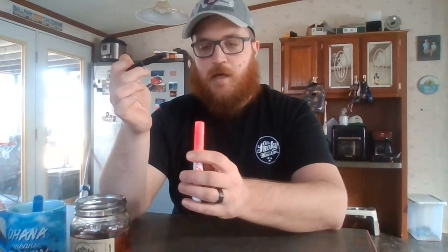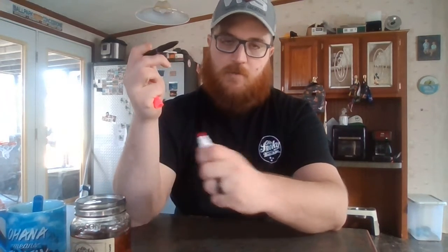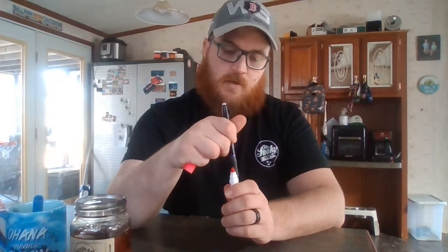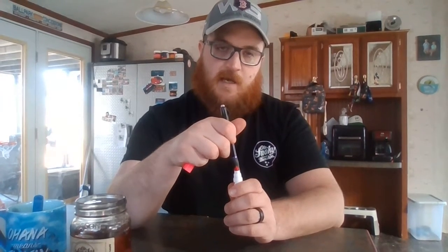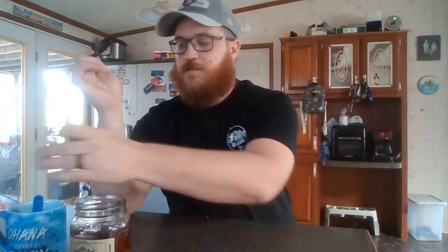This would obviously be my new broth that I had prepared to put the new culture in to grow the new bacteria. Again, same technique, just grab with the pinky. We're going to pull the tube. We're going to flame that. And then we're going to dip our inoculation loop in there to get that bacteria there. Pull, flame again to kill any bacteria that may have been transferred in those few seconds that it was open. We're going to put a cap back on that. Place that back in the holder.